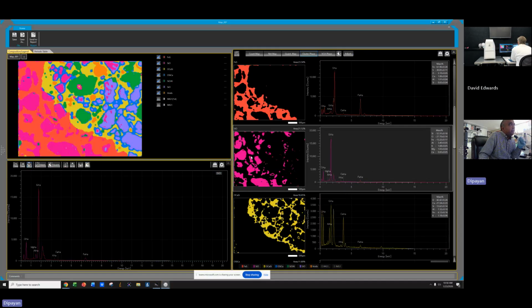I can't choose these as a representative of quartz. I loosely said it is quartz, made of the silica peak, but I don't want my future runs to show iron and alumina. They are not present in quartz. So that's my main problem of building my own library, because then I have to create the pure phases.